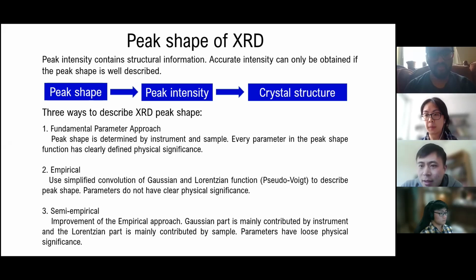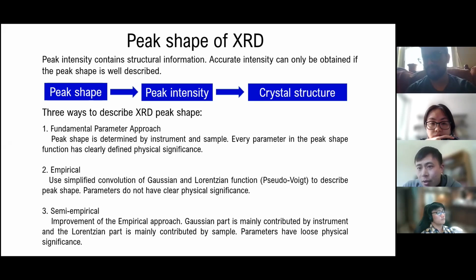So I basically used the one I previously prepared, and I think we can take this opportunity to go through the profile functions of X-ray diffraction. Something I think is very important and very practical, something we haven't touched upon yet.